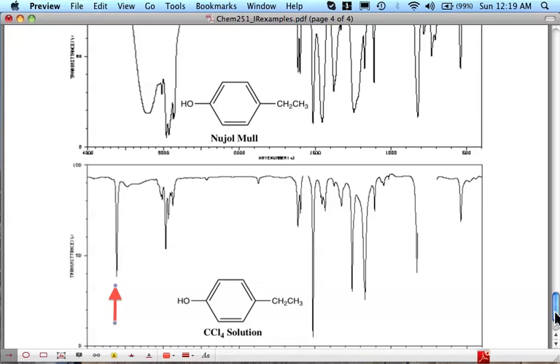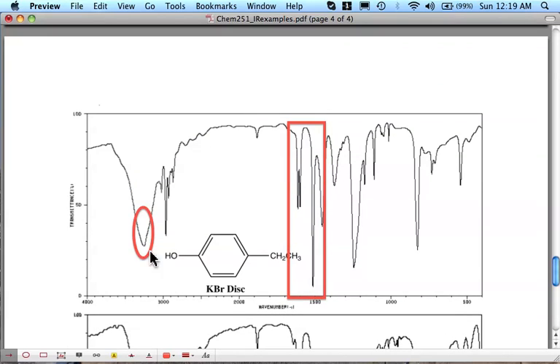Now, in our case, our new IR spectrometer that we're using now uses an ATR attachment, attenuated total reflectance, with a diamond anvil that we're squeezing the sample on, so we're not actually using any of these techniques. The best one to use for comparison purposes is probably the KBr disk method. That's probably the most similar to ours.